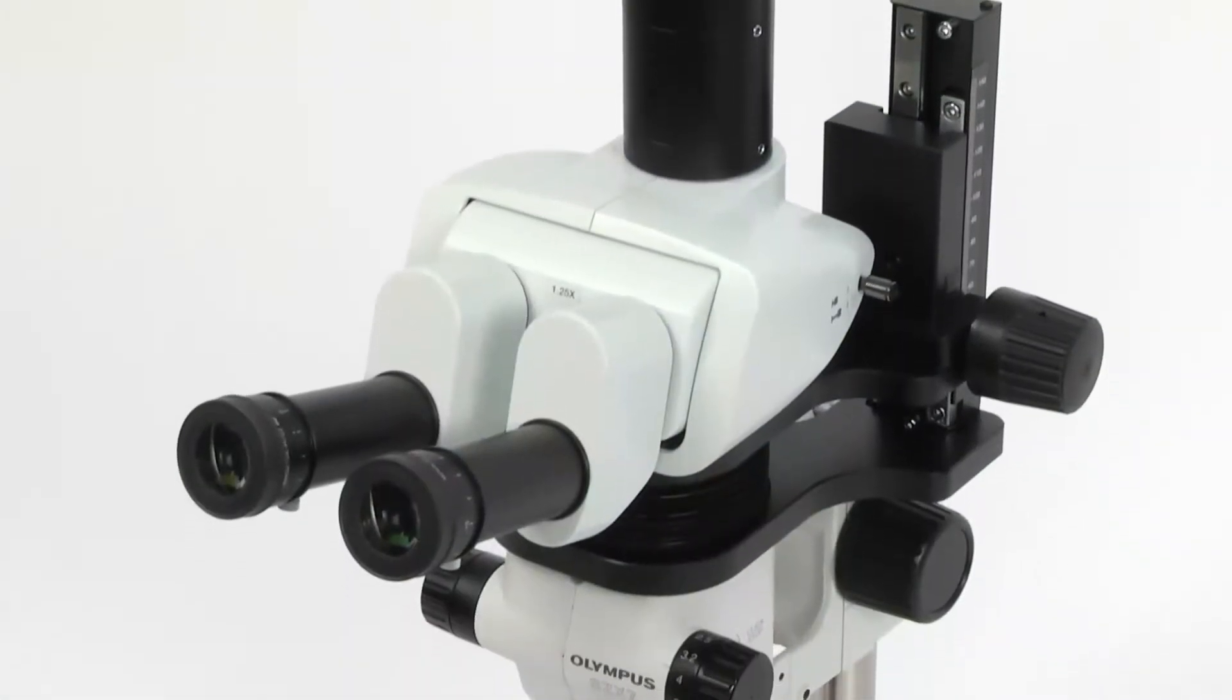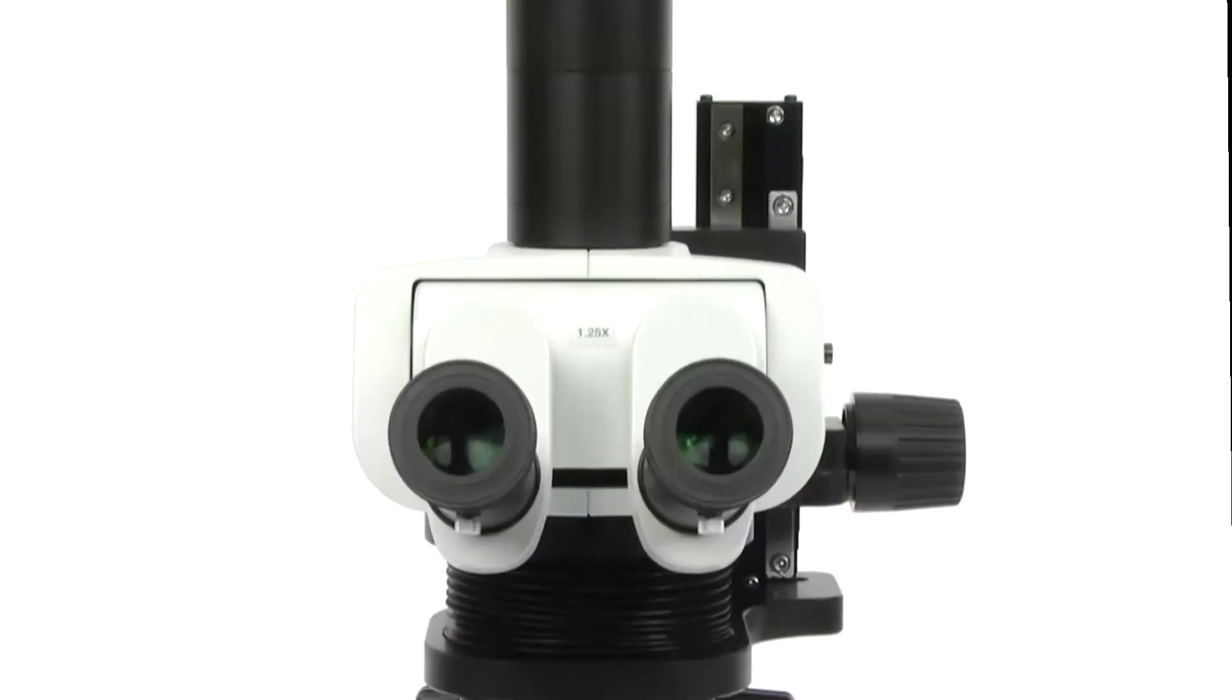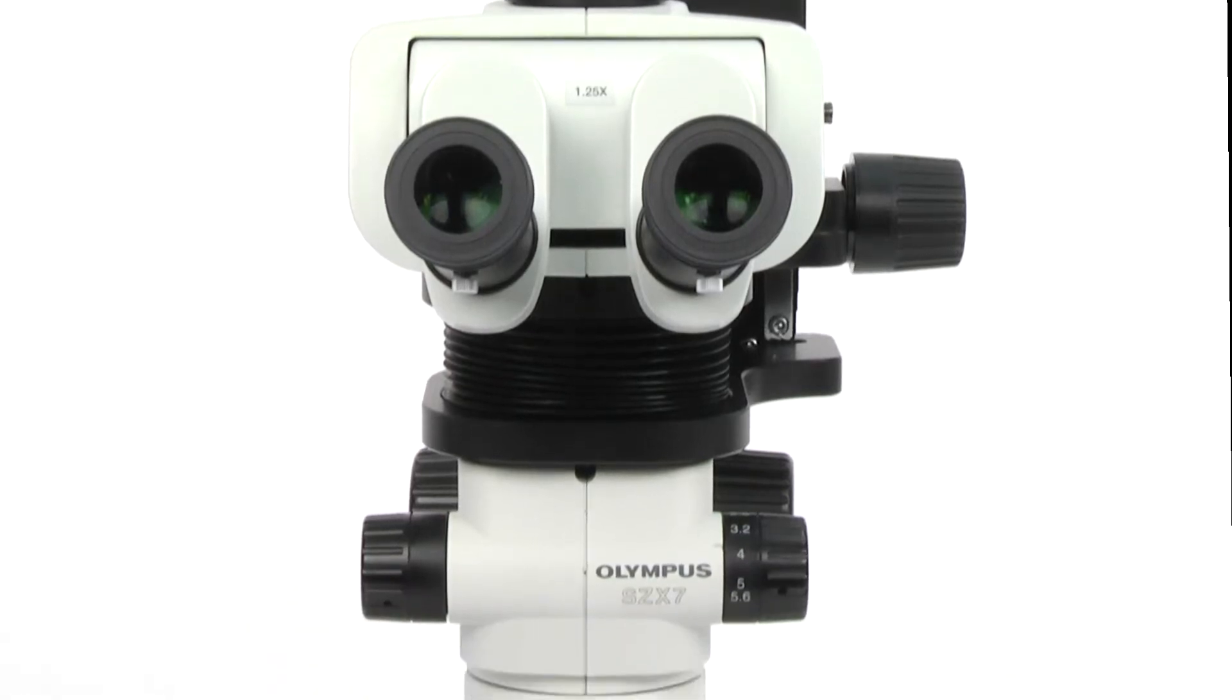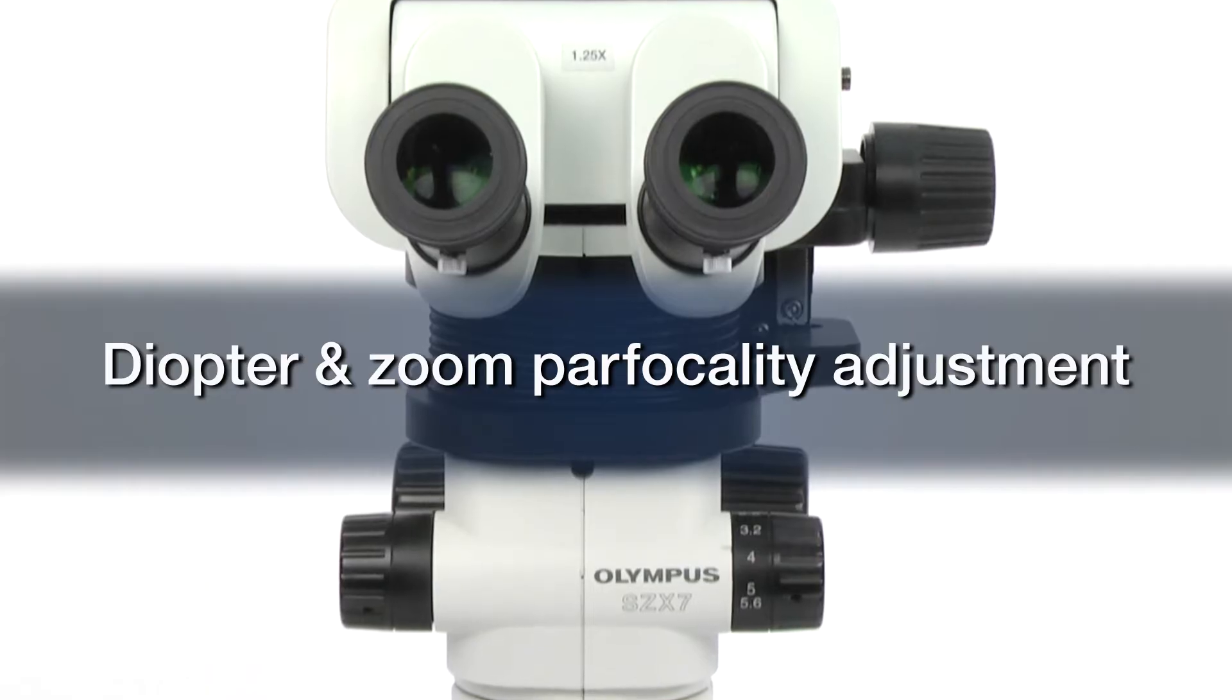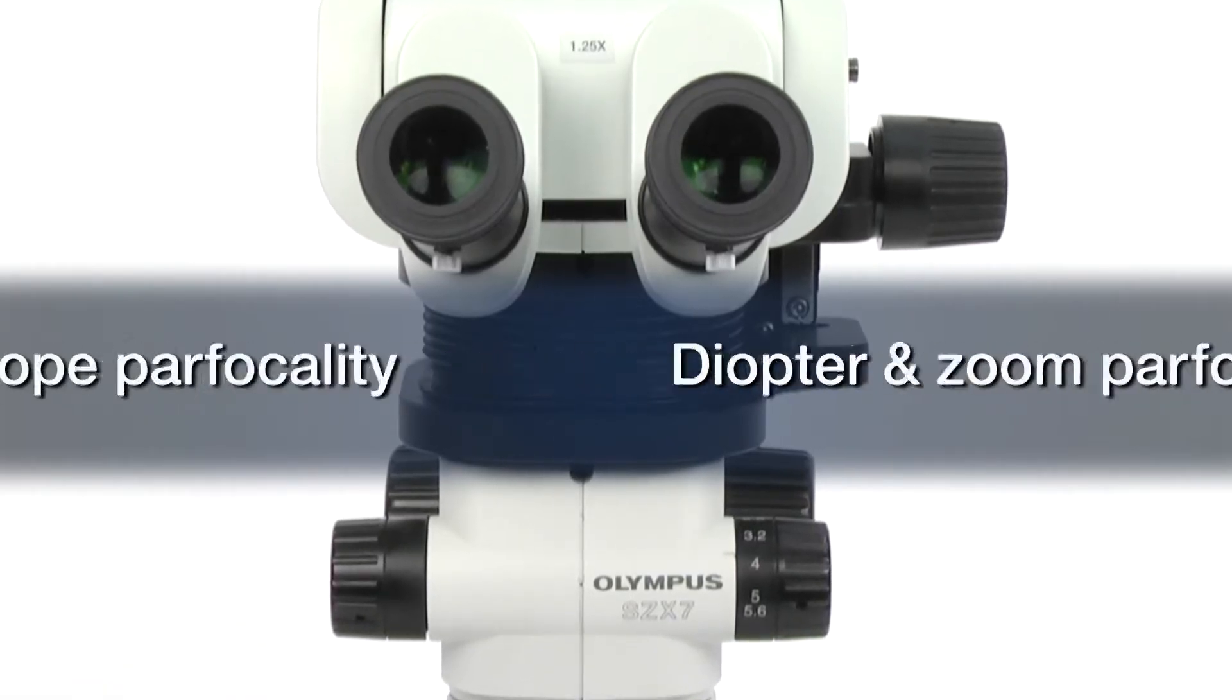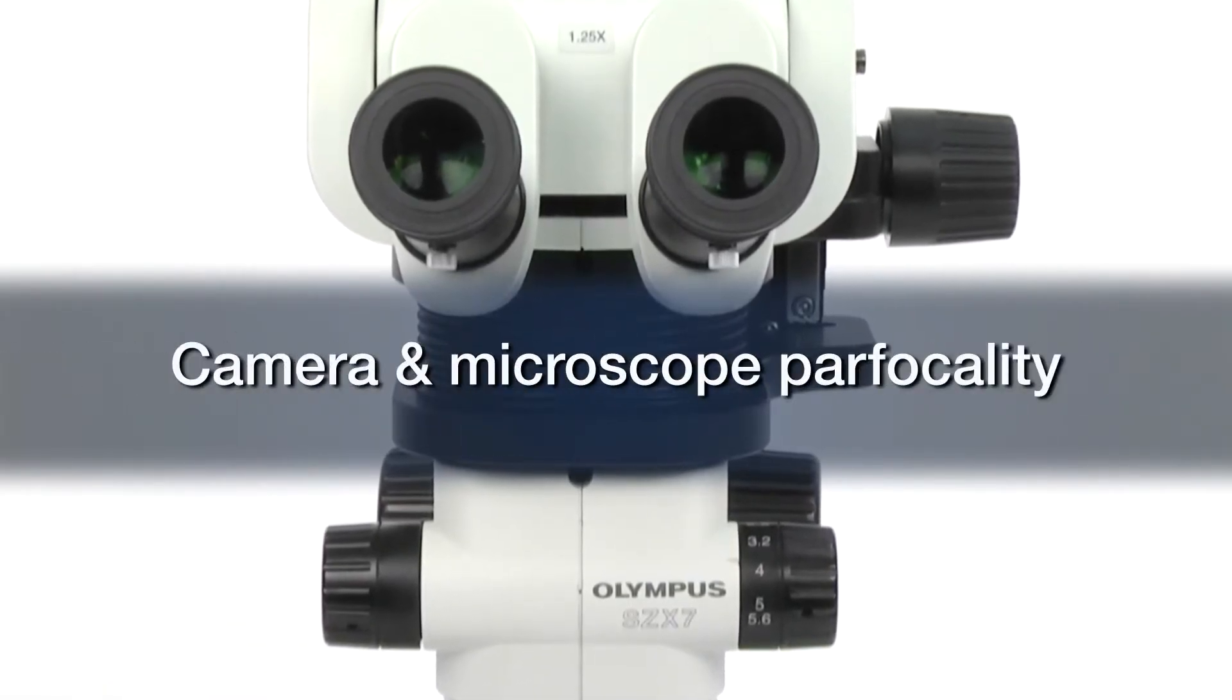For stereo microscopes, three of the most important and often overlooked elements of microscope setup are interpupillary adjustment, diopter and zoom parfocality adjustment, and camera and microscope parfocality.